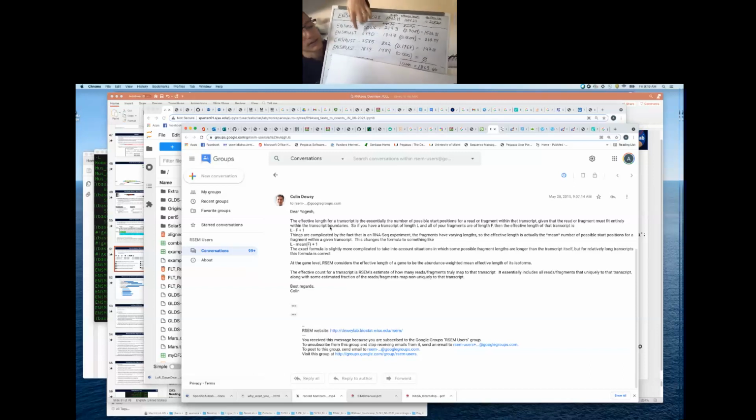So the third one in the list is actually the shortest isoform of this gene. And so you can see that there are quite a few exons being spliced out for this isoform. So it's really small. It's 832 base pairs. And then that last isoform, which actually isn't expressed in our samples, has a length somewhere between these two.